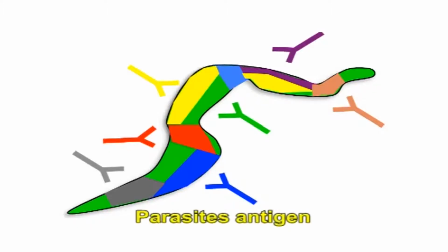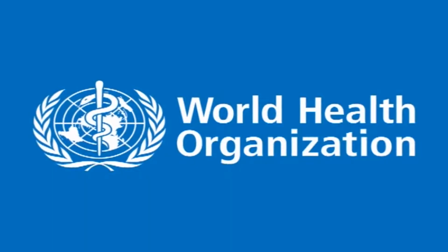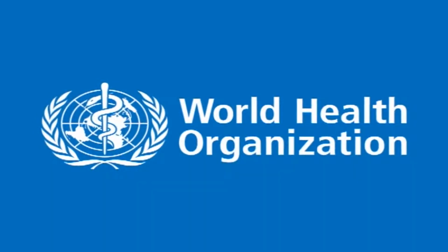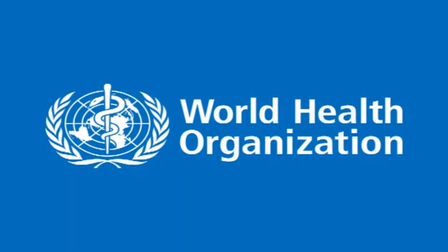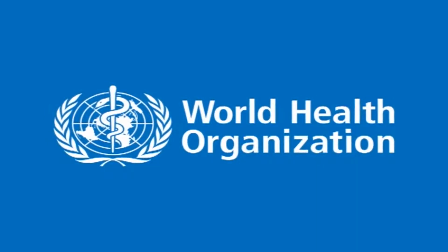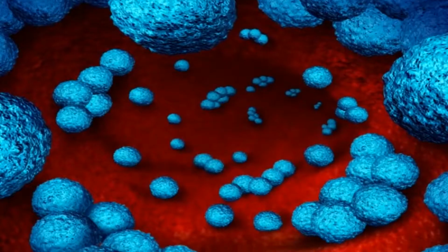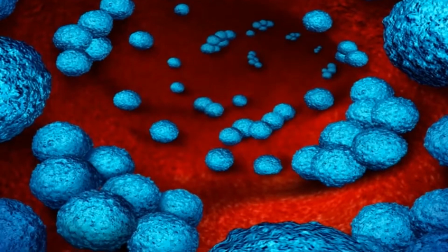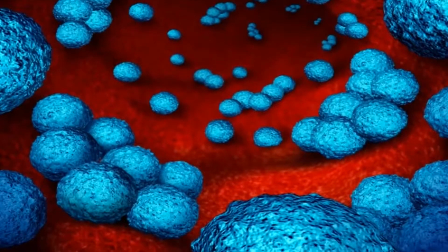For the analysis of parasite antigens, monoclonal antibodies are so valuable and appropriate that the World Health Organization organized a symposium which brought together those who have established and refined the technology and those who are currently using it or wishing to use it for the study of organisms that are responsible for some of the major diseases affecting mankind. Let us see what hybridoma technology is.